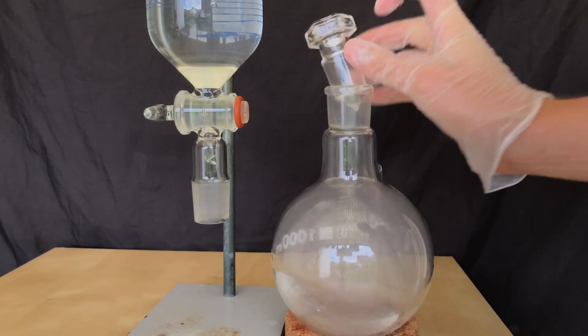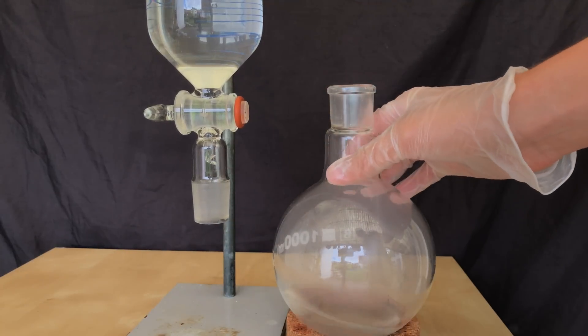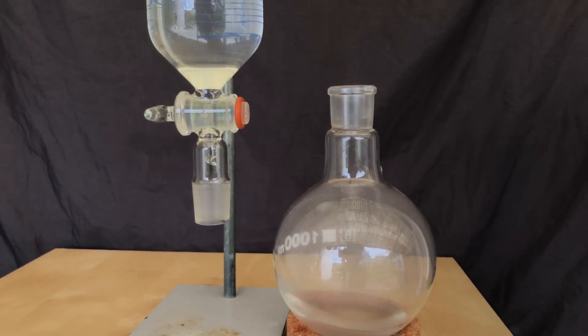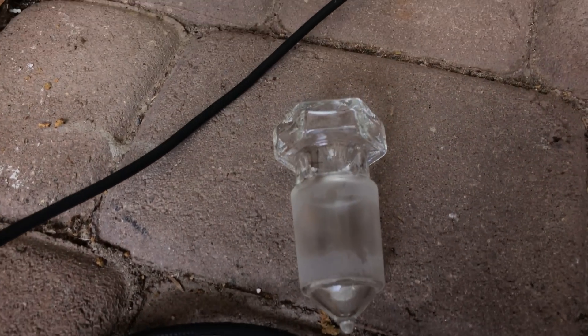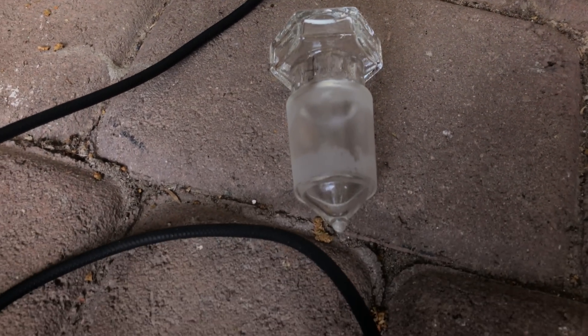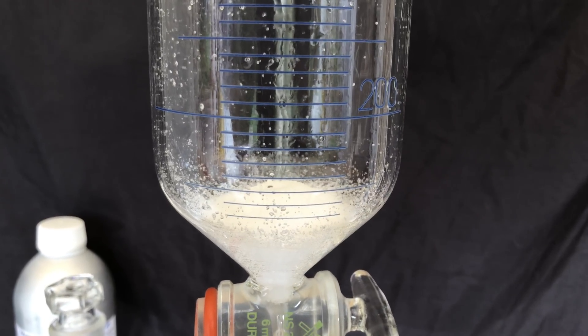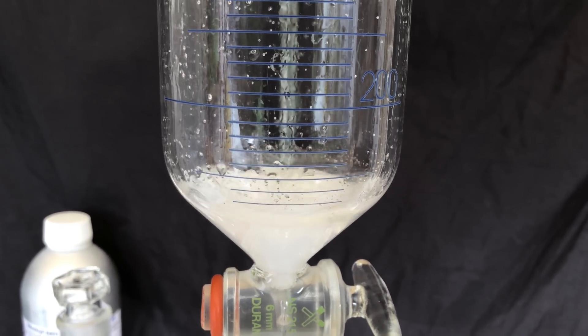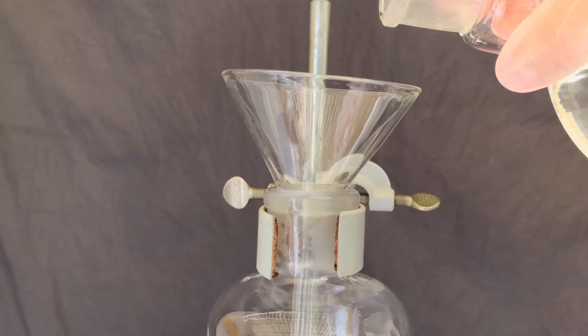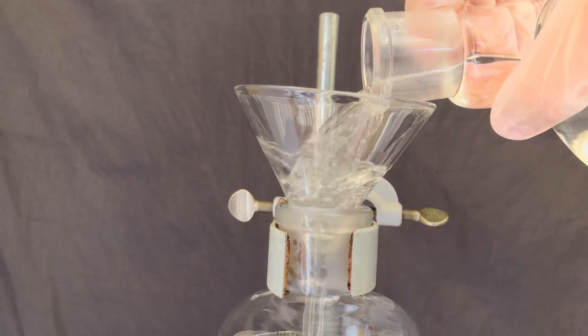I rinsed the round bottom flask with ether and this happens: ether has a high vapor pressure and it propels the stopper out of the flask. Fortunately, it survived the brutal fall onto the ground. The water layer was washed three times using 500 milliliters of MTBE in total. The combined ether layers were then washed one time using saturated sodium chloride solution. This washing step should dry the ether layer even further while also removing some contaminants.